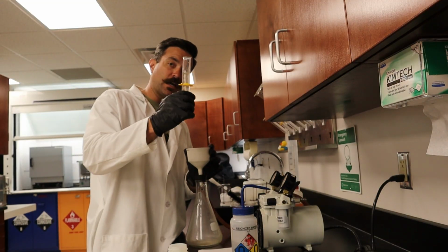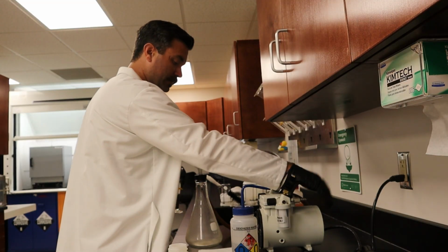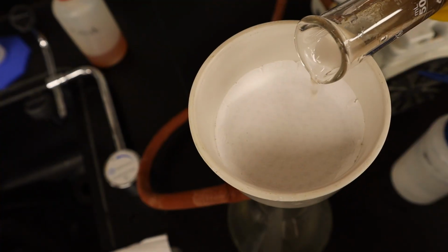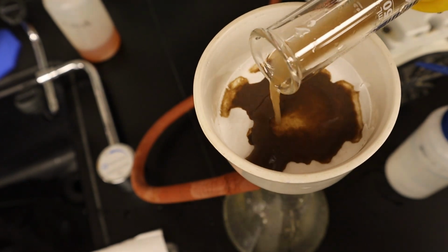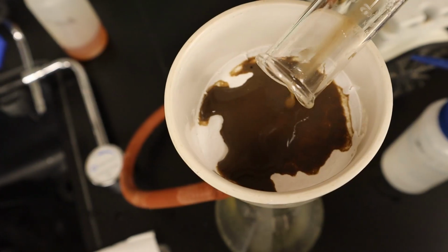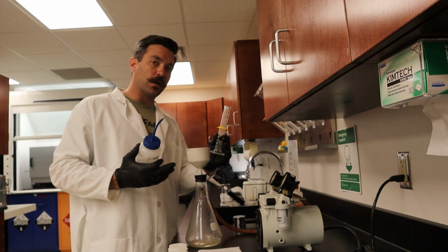Now we have our sample poured up into our graduated cylinder, so let's pour it over our filter here. And the biggest thing to remember is not to flood your filter. You don't want to just fill up this whole funnel and have stuff going everywhere. Keep it contained on the filter, pour it as slow as needed. I really don't have to worry about that with this small of a sample.